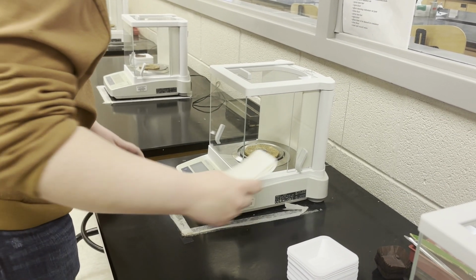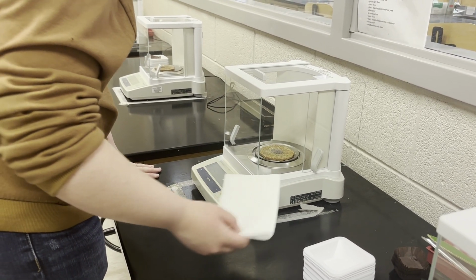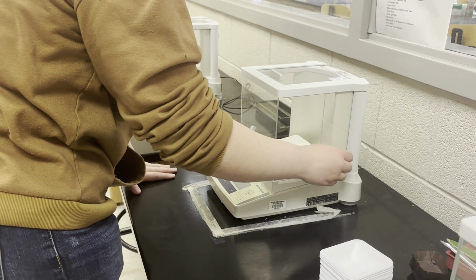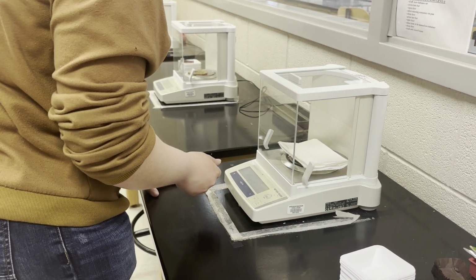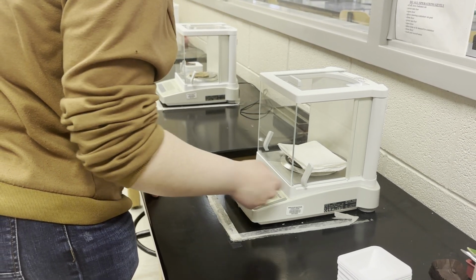Once dried, the green onions were placed on an electric balance inside of the paper towel. After being measured, green onions were taken out and the paper towel weighed. The mass of the paper towel was then subtracted from the initial mass taken to find the final dry mass of each experimental group. Since each group did not end with the same number of plants, the final dry mass was divided by the number of samples per category for an average dry mass. From the data collected, 3 graphs were created.